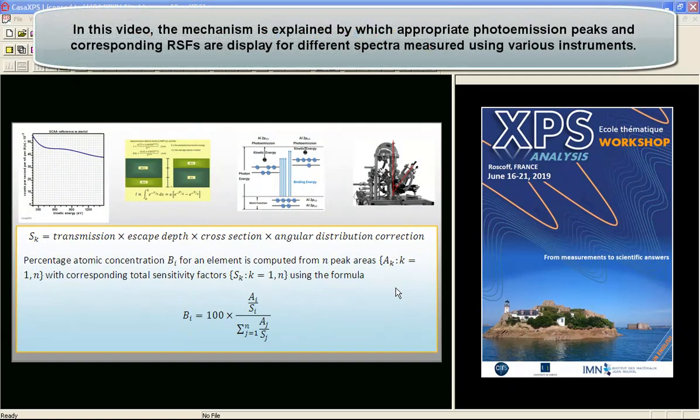An element library in XPS serves two functions. One is to identify peaks within an XPS spectrum, and the other is to assist the quantification by XPS.